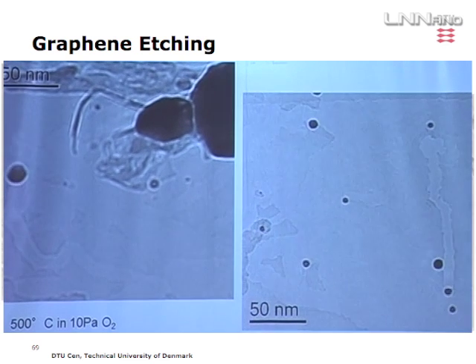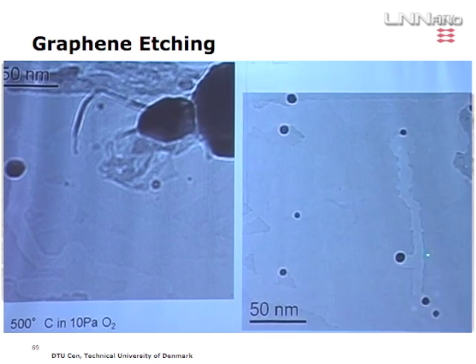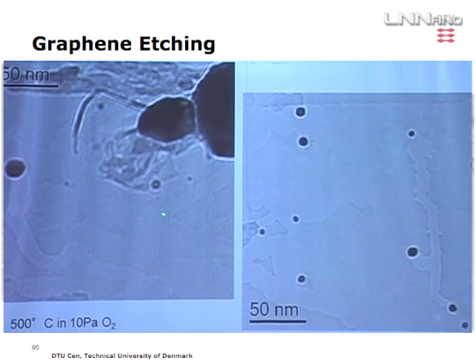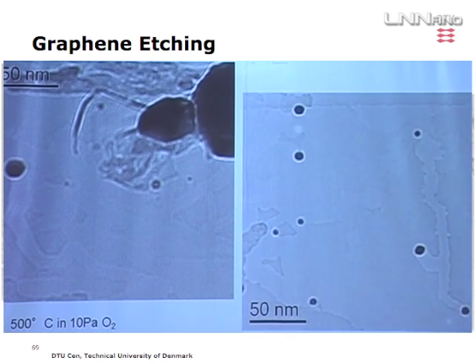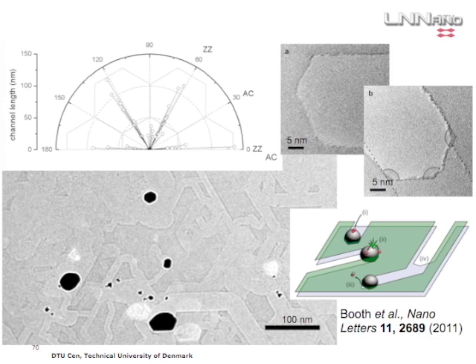And just to show you, this is not a single case. I have another one over here. You can see the particles are digging trenches. What you may have noticed is that there are some very characteristic angles between these channels over here. And if you start to analyze them, this is what you get.